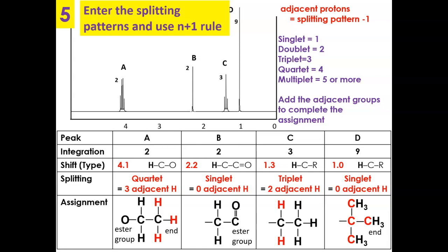And if you look carefully, of course, the carbon with 3 methyl groups on it has no protons of its own. And so the CH2 must bond to the carbon with the 3 methyls. That must be the other end of the molecule.